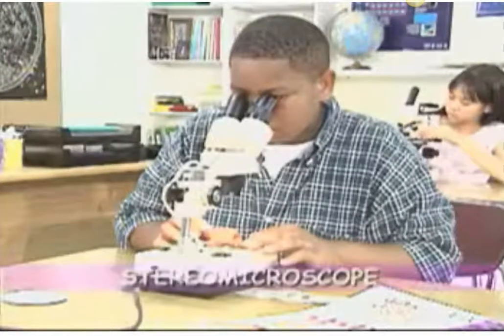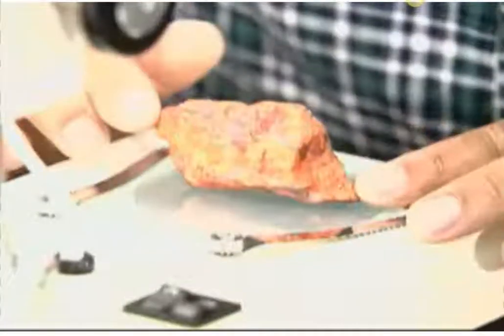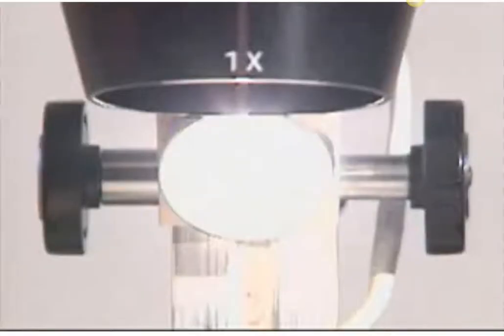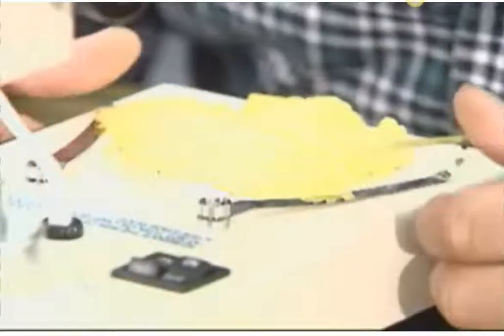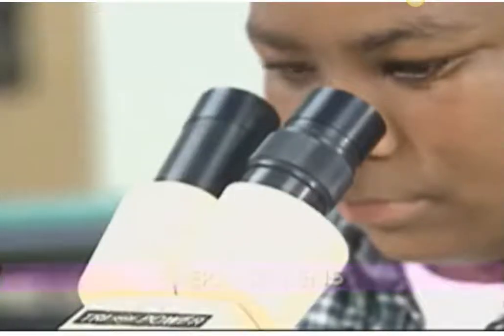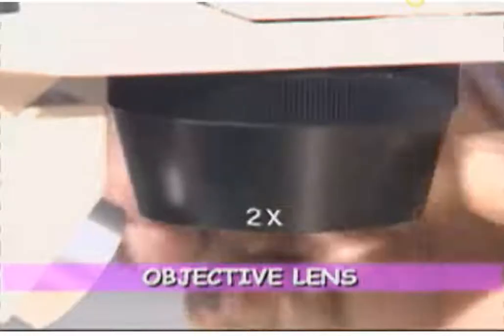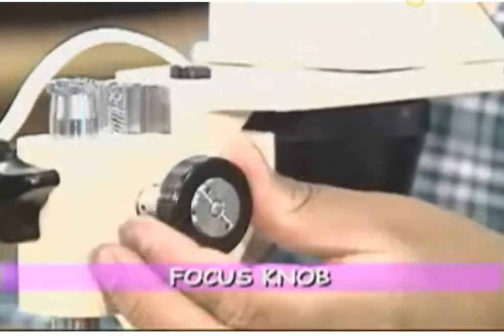A microscope you might already be familiar with is a stereo microscope. Objects are placed on a platform called a stage. Solid objects are illuminated by a light from above, while thin or transparent objects can be illuminated from below. The lenses on a microscope are referred to as the eyepiece lens, there are 2 on a stereo microscope, and an objective lens, which often has changeable magnifications. The microscope is focused by turning the focus knob.